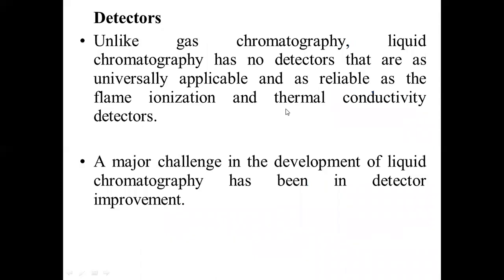So apart from this, once separation of the solute is completed, it is very essential to find out information about the solute: what kind of solute has been eluted from the chromatography column, or what is the quantity of the solute eluted.